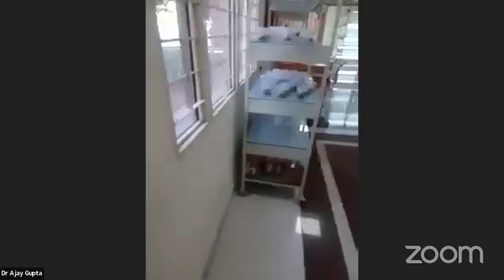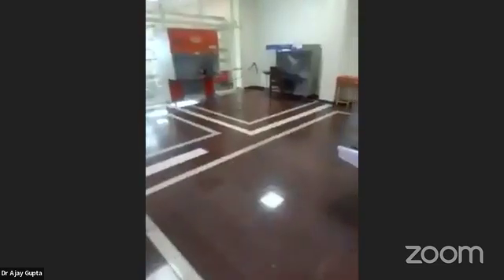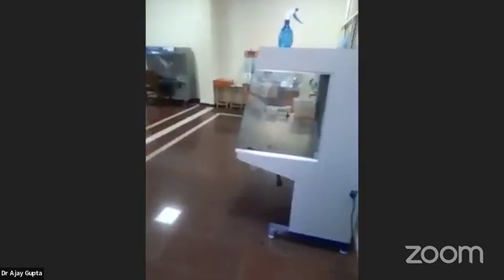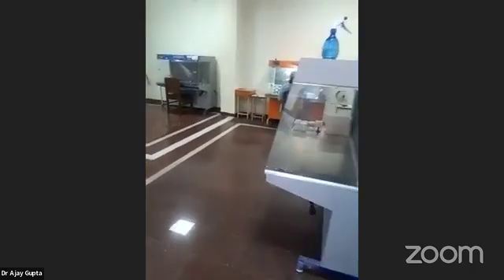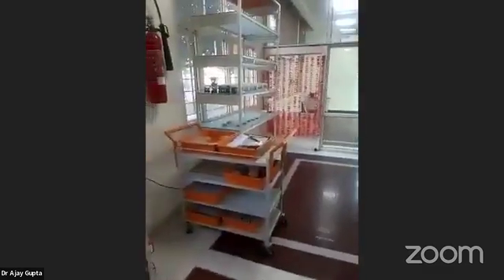So now this is the inoculation room. We are entering into the inoculation room. Here you have the different aseptic chambers. So these are the aseptic chambers. This is our inoculation room. So you can see, these are the media basically made.